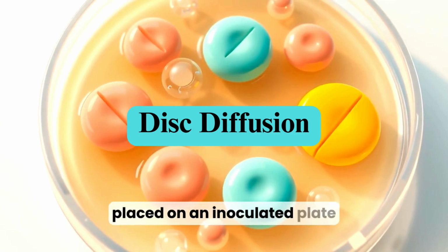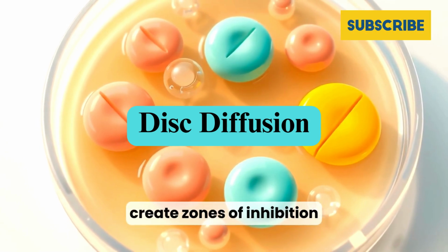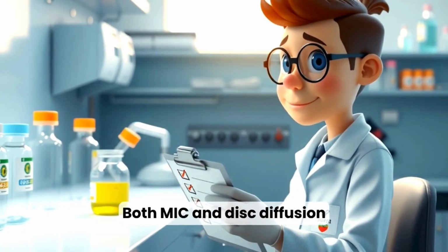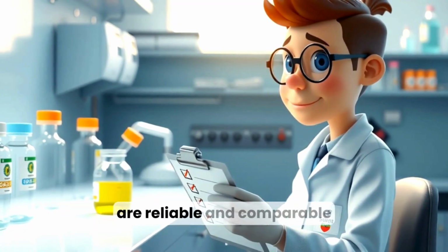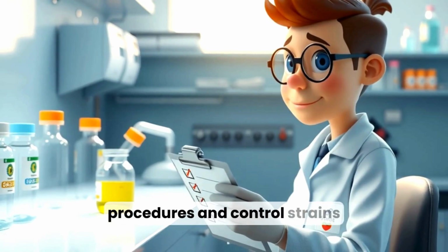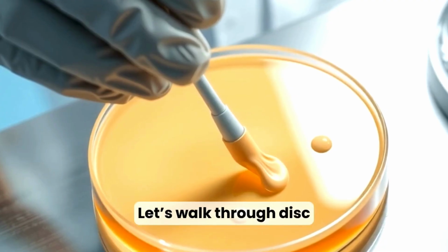Antibiotic discs placed on an inoculated plate create zones of inhibition where bacteria can't grow. Both MIC and disc diffusion are standardized so results are reliable and comparable across labs, using clear procedures and control strains. Let's walk through disc diffusion.